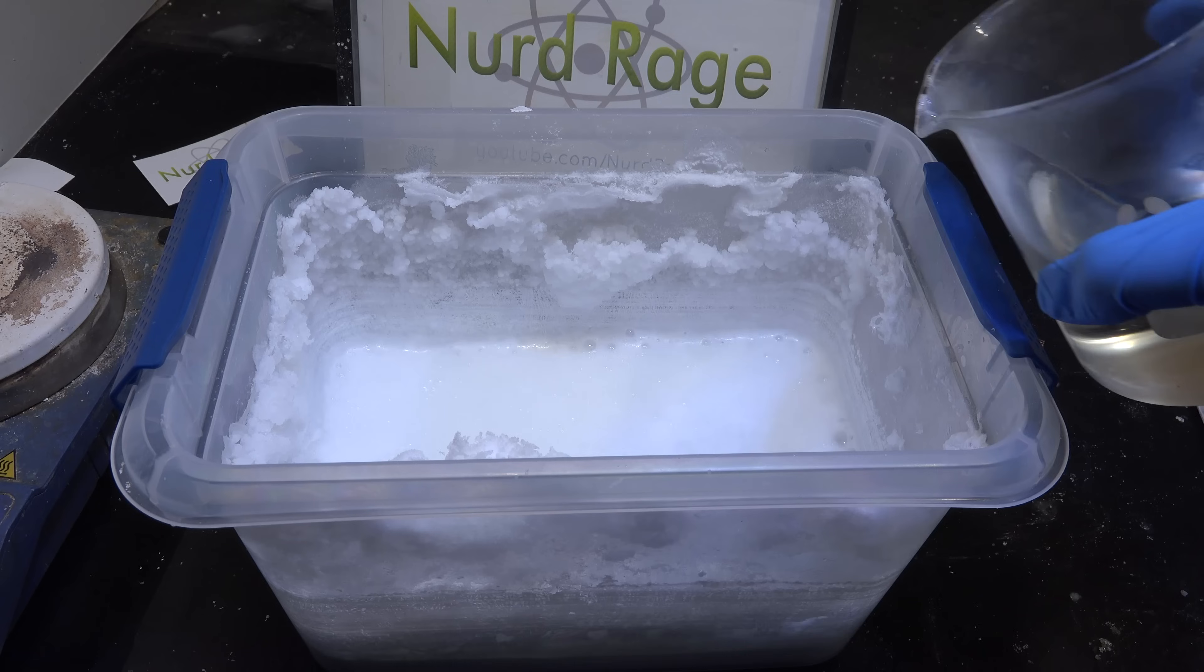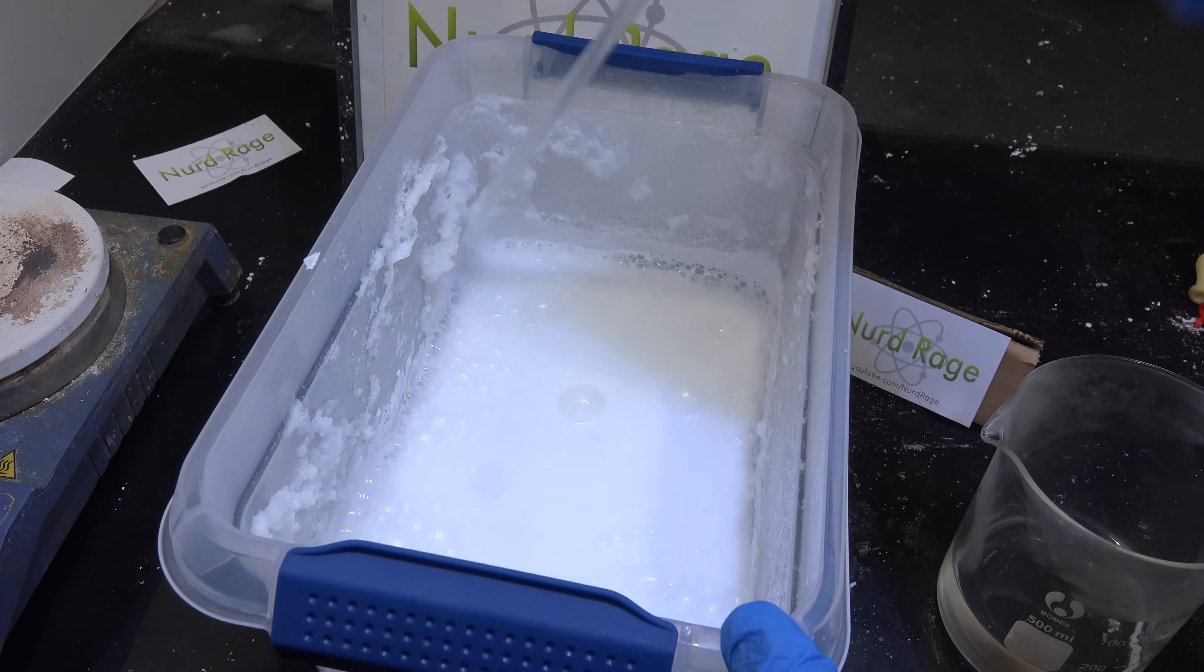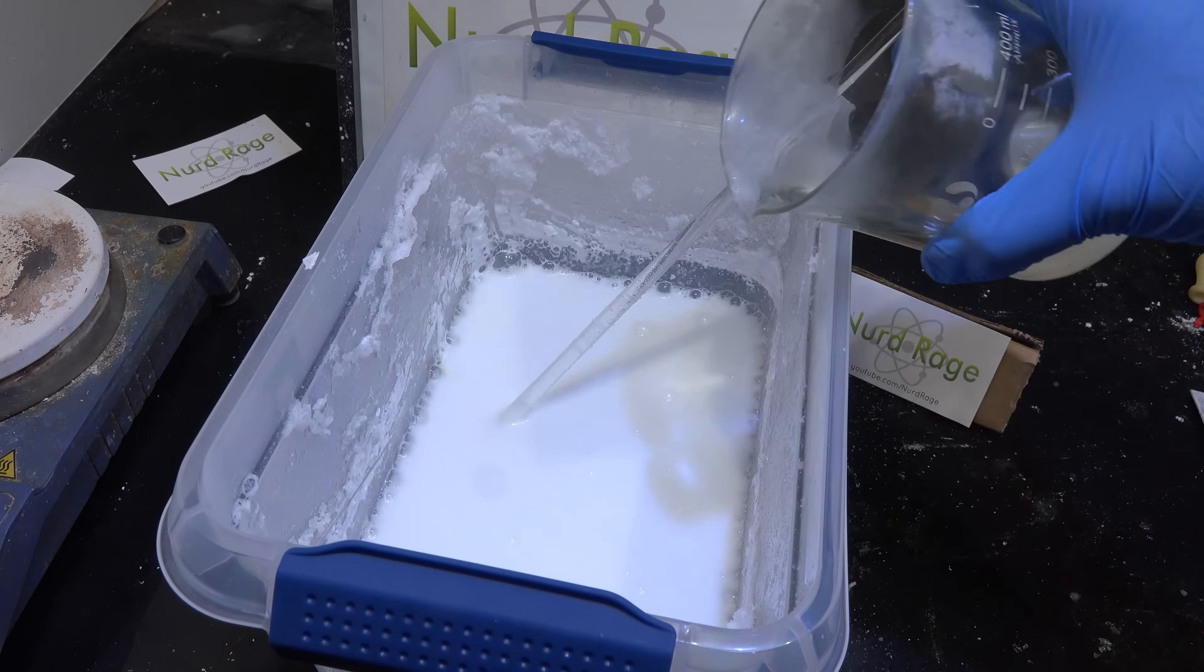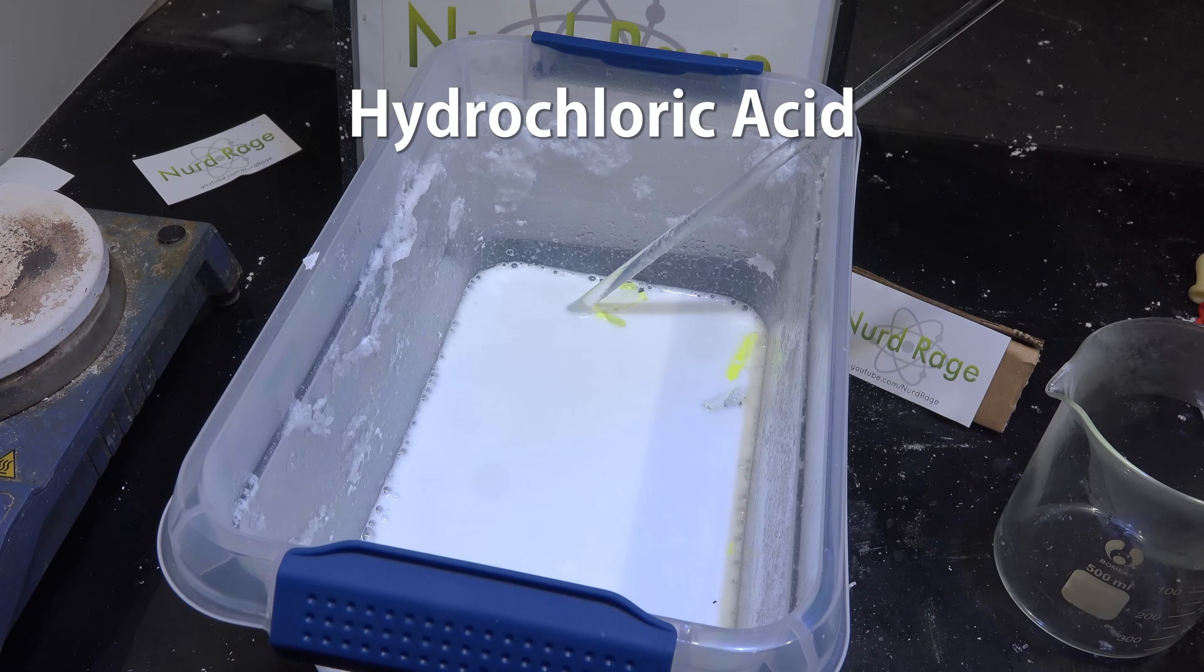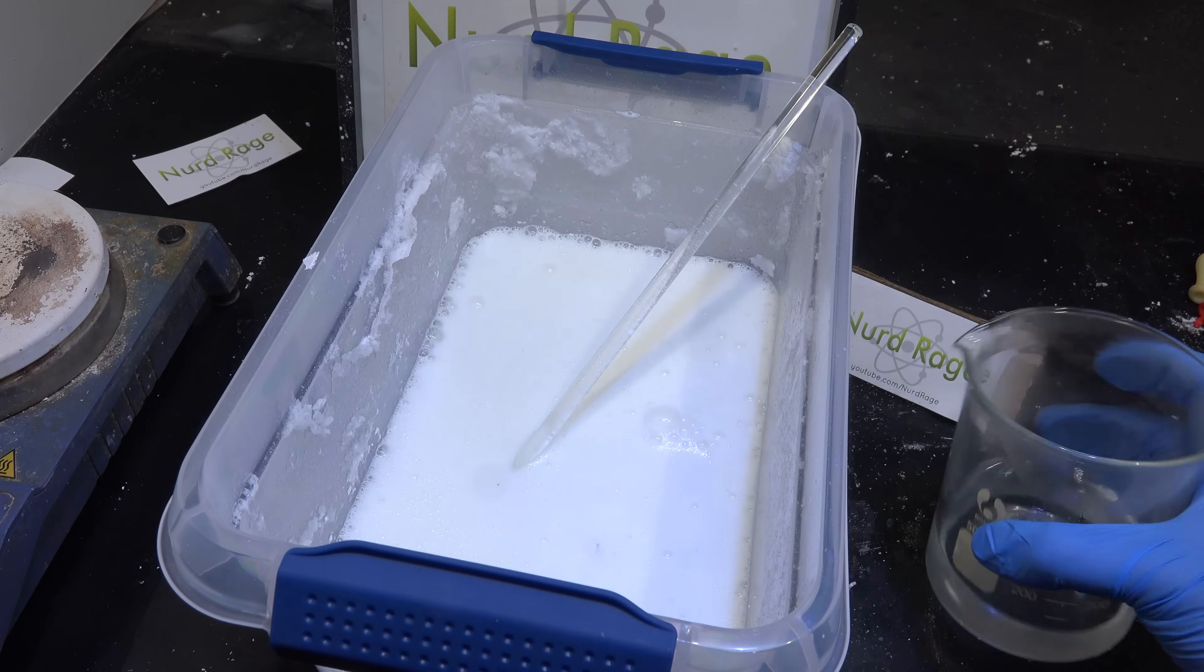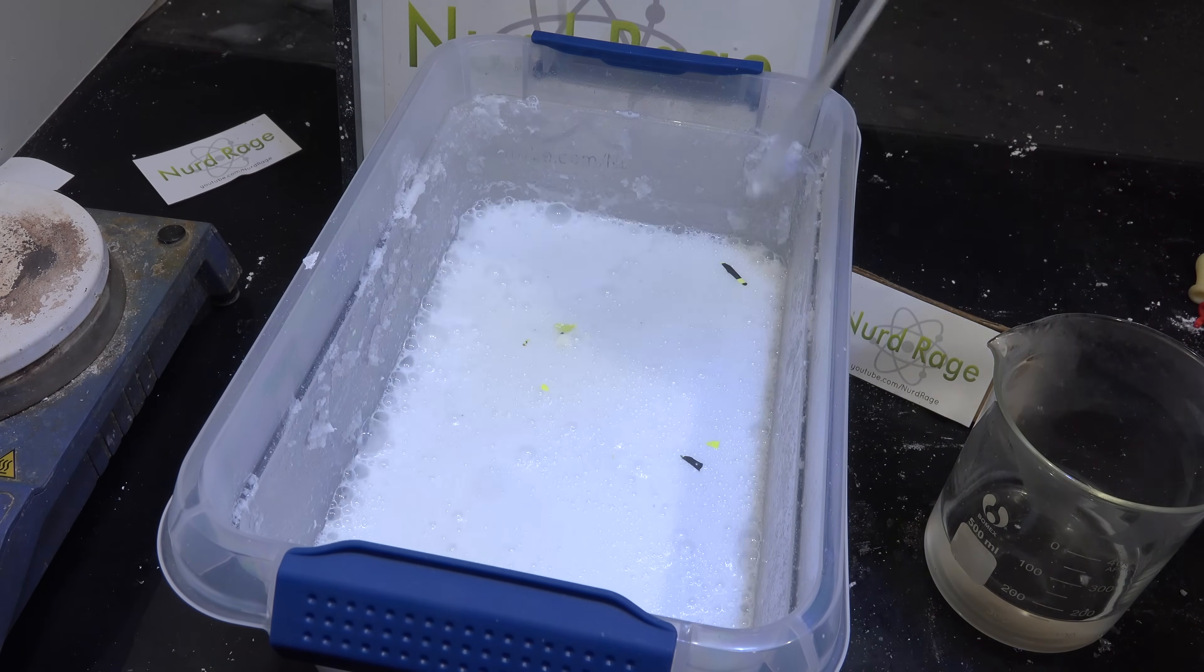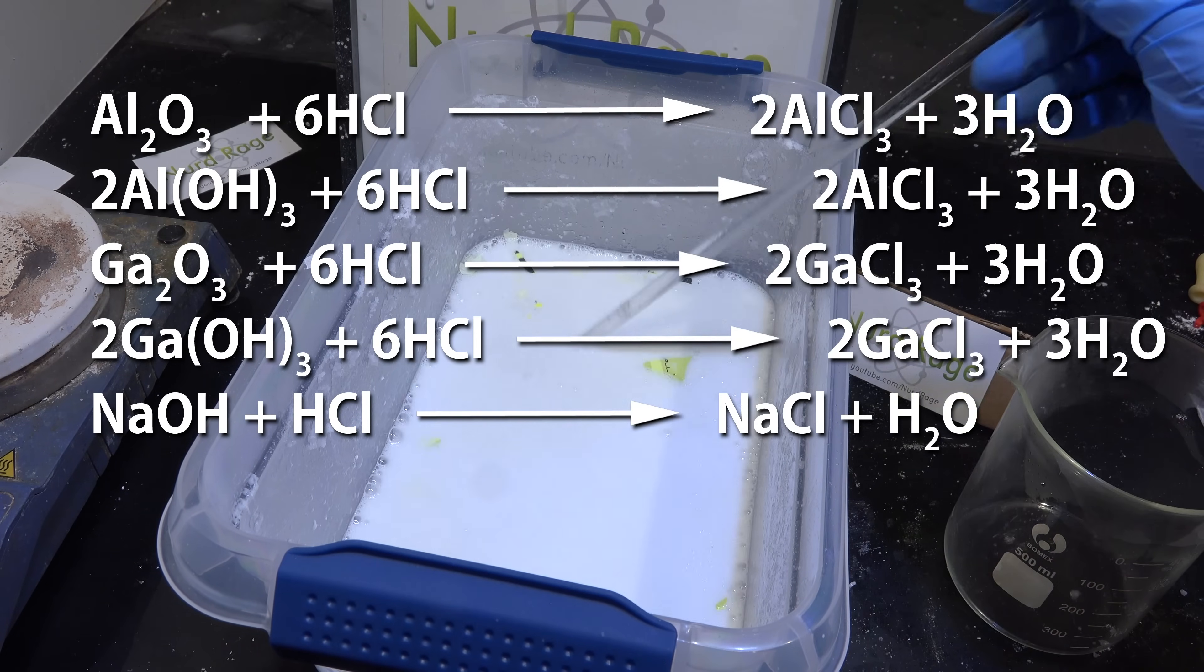Now this waste is mostly aluminum oxide as well as sodium hydroxide and tiny amounts of gallium hydroxide. First we'll need to neutralize all of it with concentrated hydrochloric acid. It's bubbling because it's releasing carbon dioxide. It absorbed a lot while sitting at the back of my lab for the last couple of months.